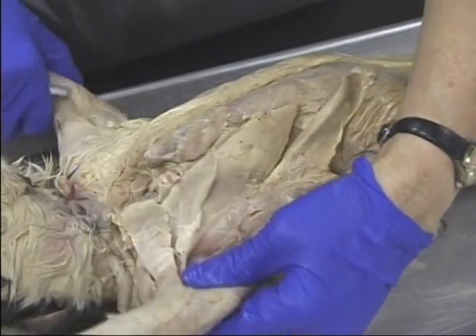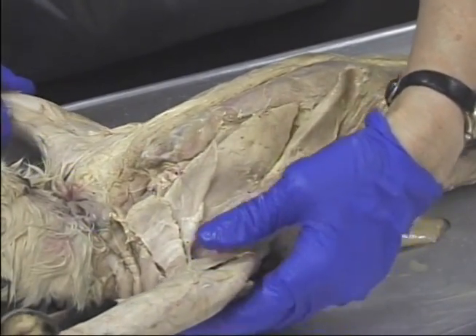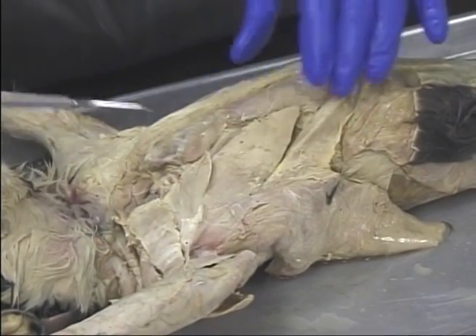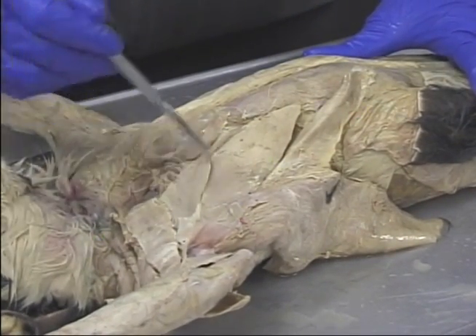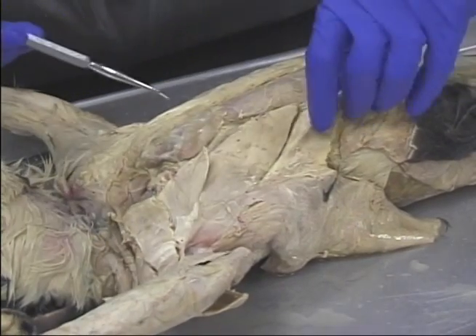You'll notice that this animal has a distortion in terms of its shoulders, so we're not going to get to pull them back over. Pectoanabrachialis, pectoralis major, pectoralis minor, ziphihumeralis.